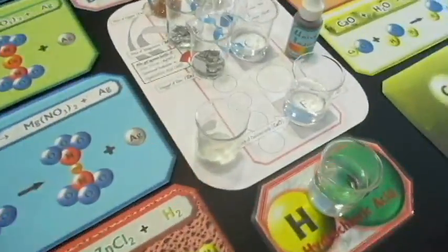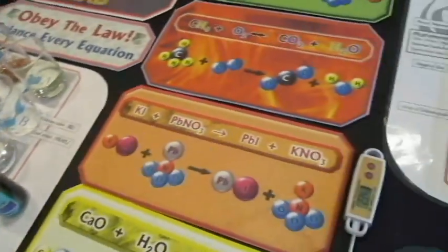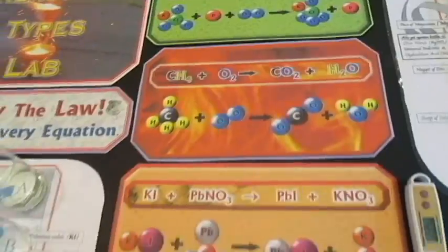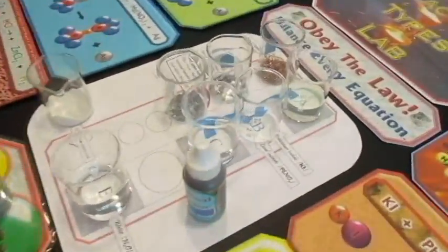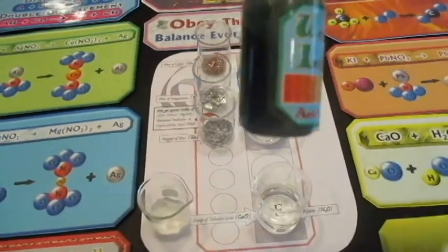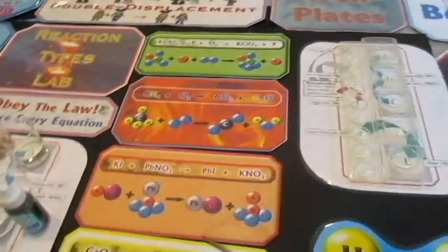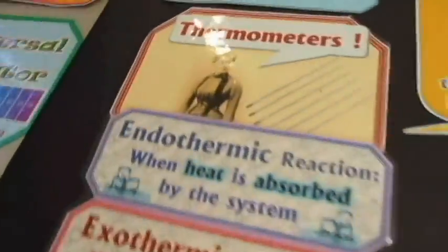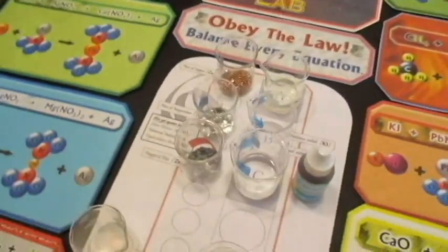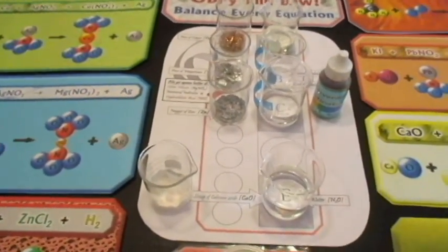And then pay attention to these reactions, pay attention to what happens, and try to understand where those products are. Are they solids? Are they gases? Are they coming out in what form? Also, look for the signs of a chemical reaction. One sign is a change of indicator color. That's a sign. Change of temperature on your thermometer. That's a sign of a chemical reaction. A precipitate forming. Okay, light, evolving a gas, you know, making bubbles is evolving a gas.